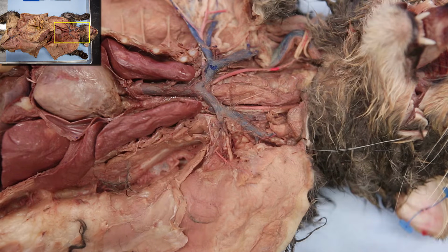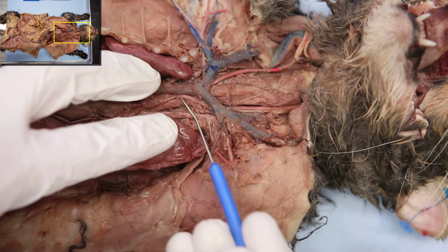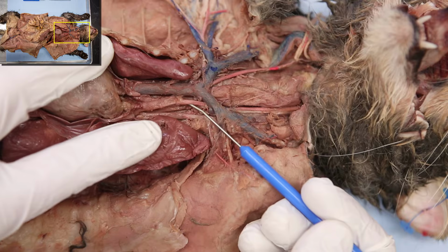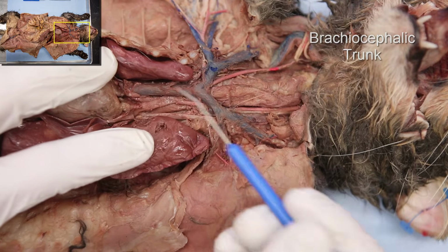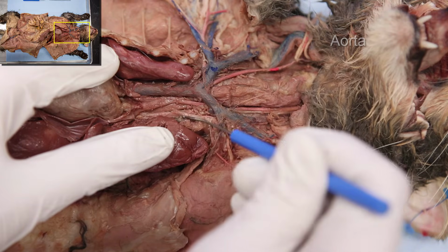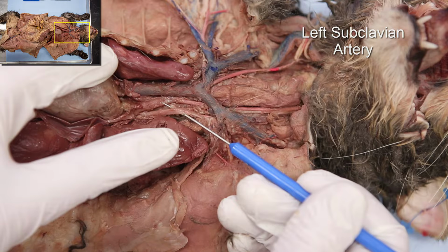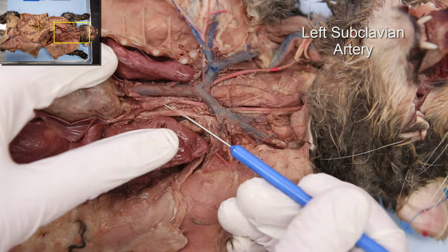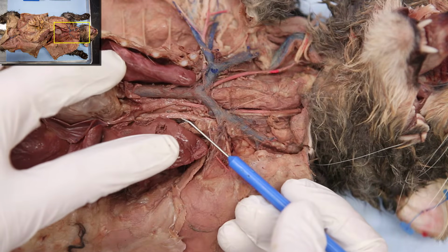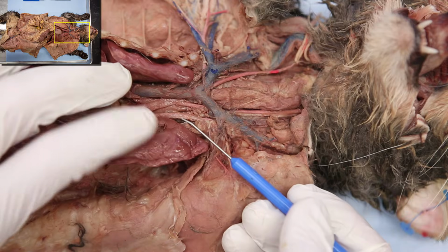Going back for the arterial flow, if we come down here, you can see that this vessel right here is the brachiocephalic trunk coming off of the aorta. And right here, this one is the left subclavian artery coming off of the aorta. Now in the case of the cat, there are only two branches coming from the aorta. Remember, in humans, there are three branches off the aorta.